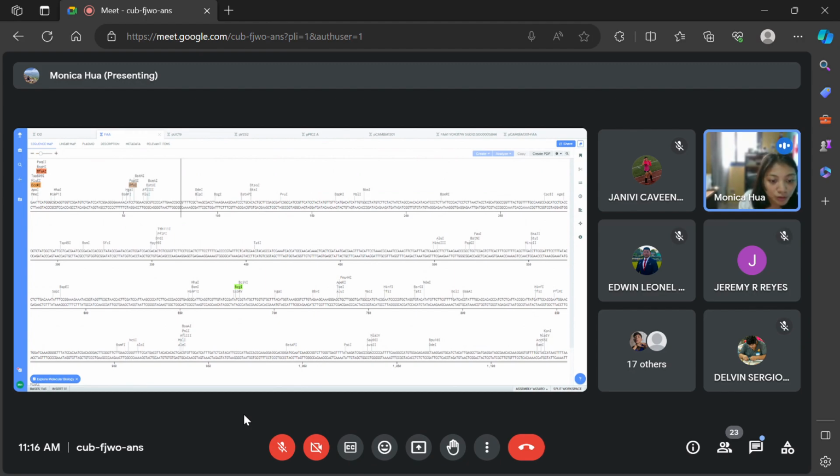That's a good thing with Benchling. Now I have to do the old time method. I didn't know they had that, so I had to freehand it. A, T, T, C, G. This will be G, C, T, T, A, A. Oh, oops.